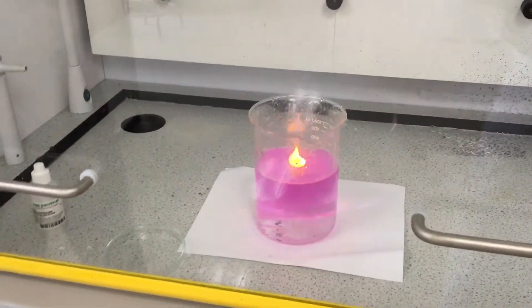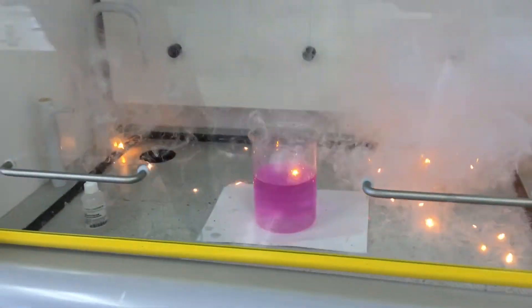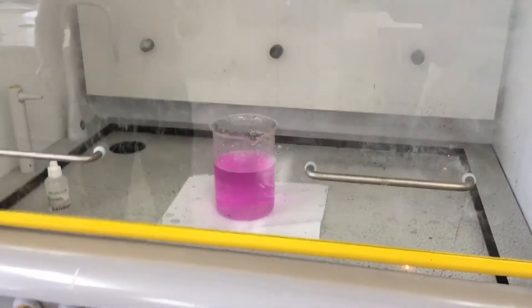Okay, so what do you think? More reactive than lithium? Oh my goodness — it came out of the fume hood. All right, let's hear it! Woo!